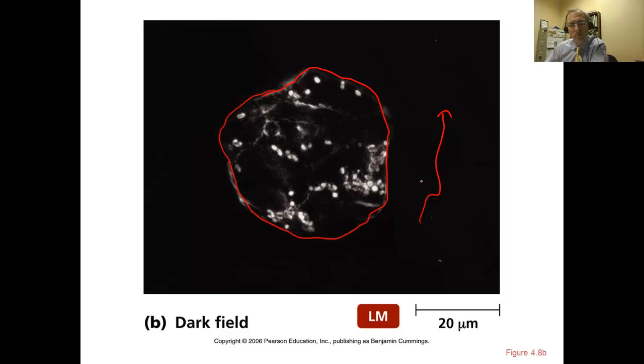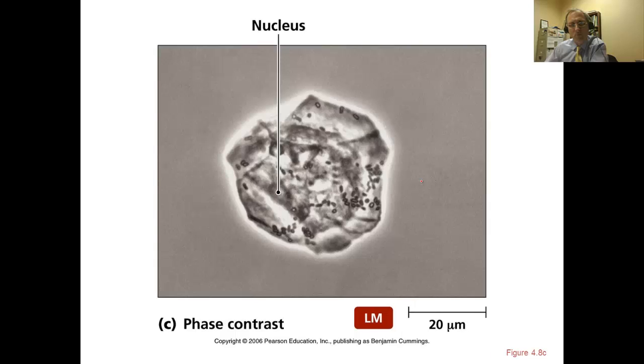Phase contrast microscopy, in this we've simply adjusted the light path a little bit more by sticking that annular phase ring between the light source and the condenser lens. Now, with phase contrast microscopy, the periphery of this microorganism is extremely easy to see. And in fact, we can now spot this organelle that wasn't apparent before. This is in fact the nucleus.